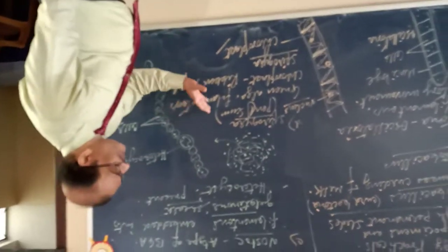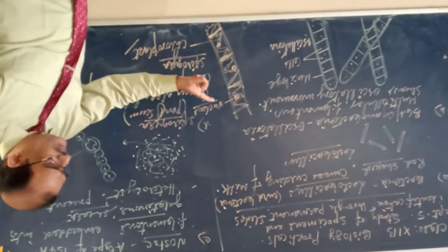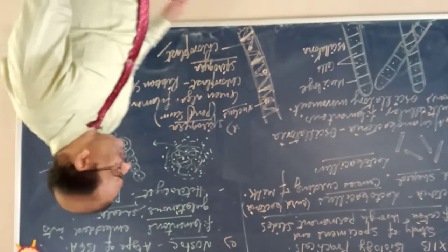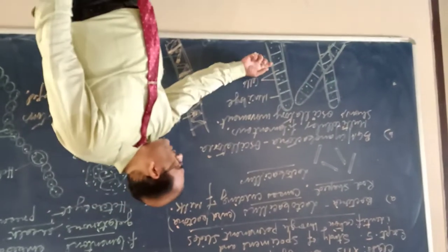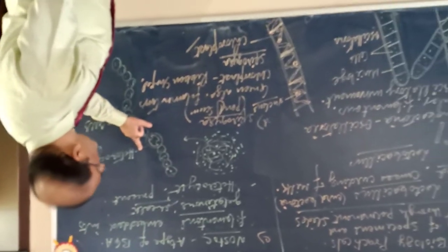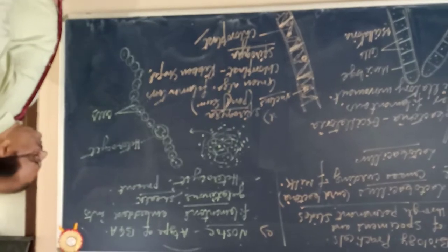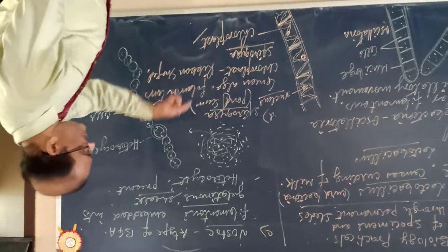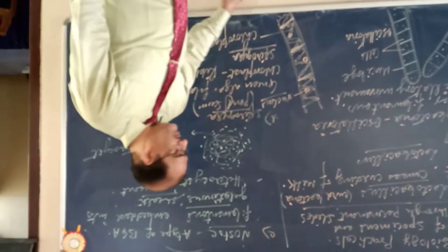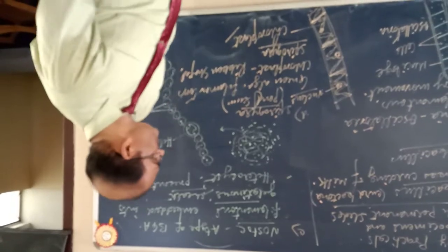So these we have discussed: four slides. Lactobacillus, Oscillatoria, Nostoc, ठीक है, Nostoc and Spirogyra. One more I would like to discuss the slide of.